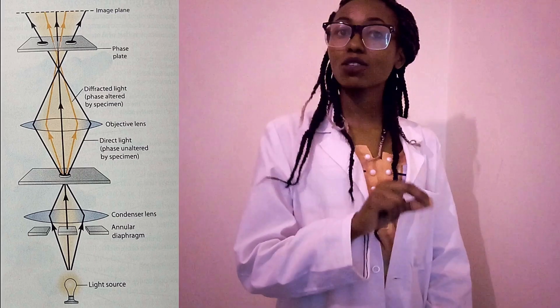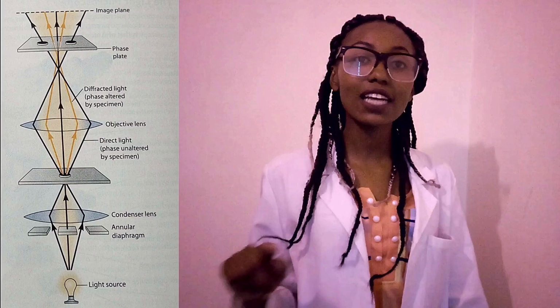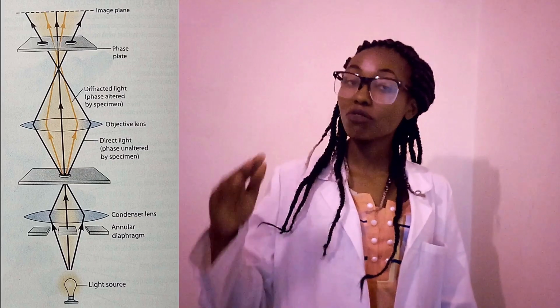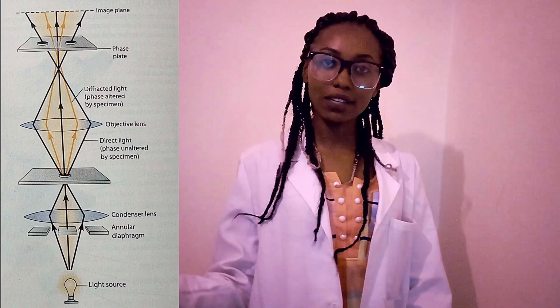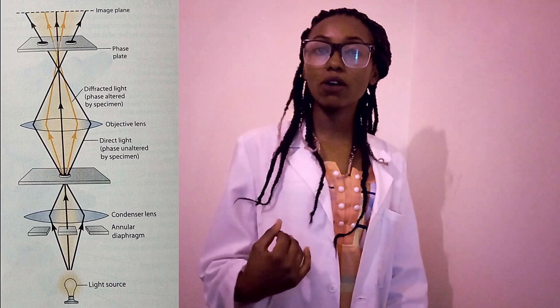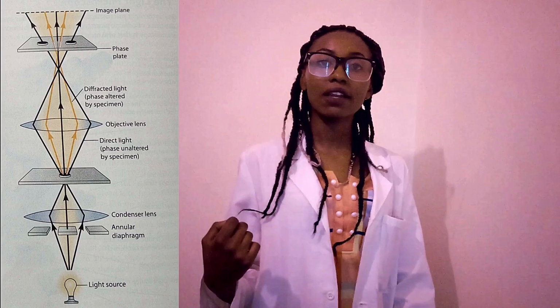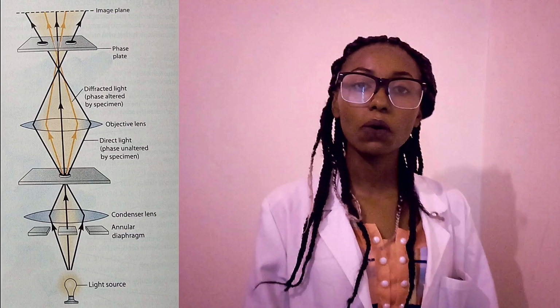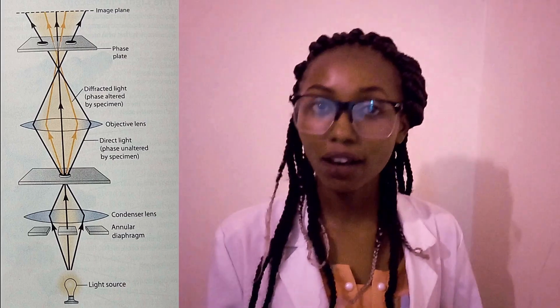Since the phase contrast microscopy, from the name, has a phase plate, the phase plate will be able to convert the interfered light to form altered brightness. This is an advantage because one will be able to detect the living specimen and the tissue culture. The disadvantage of this type of microscope is that one cannot detect a thick organism.